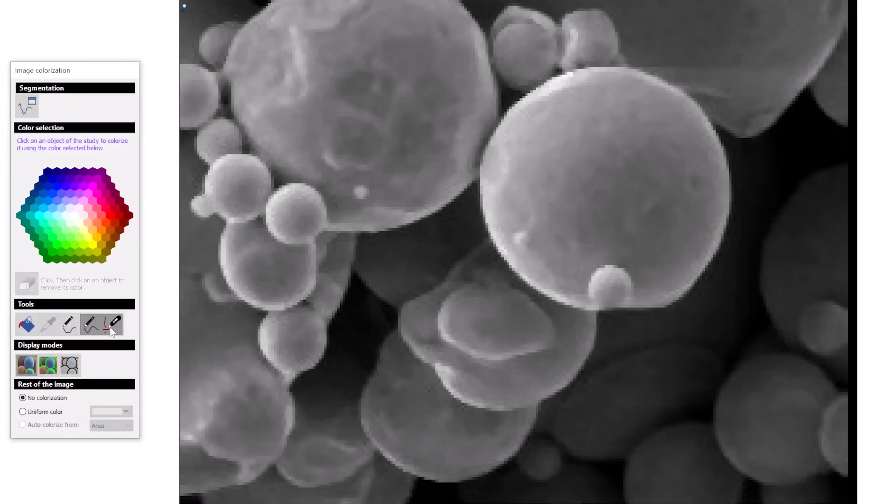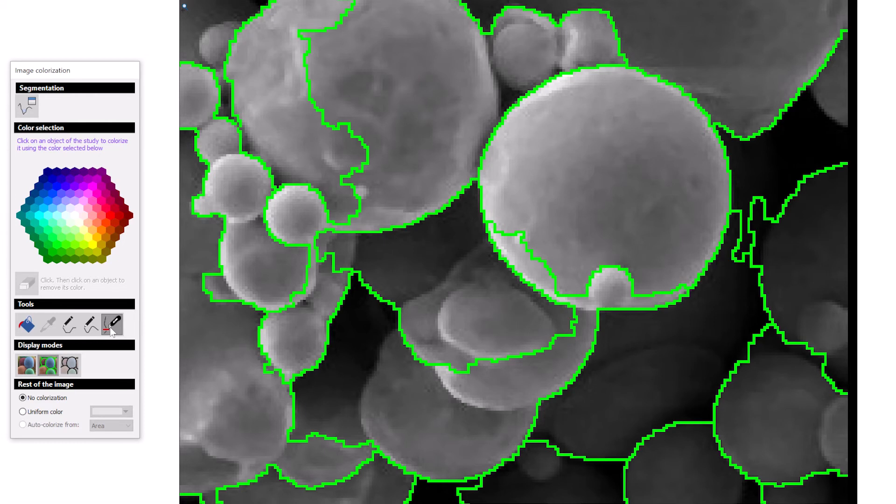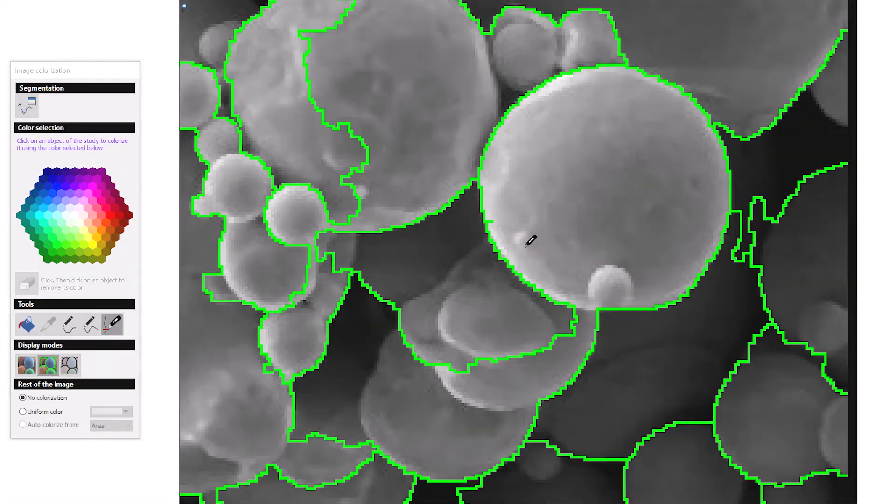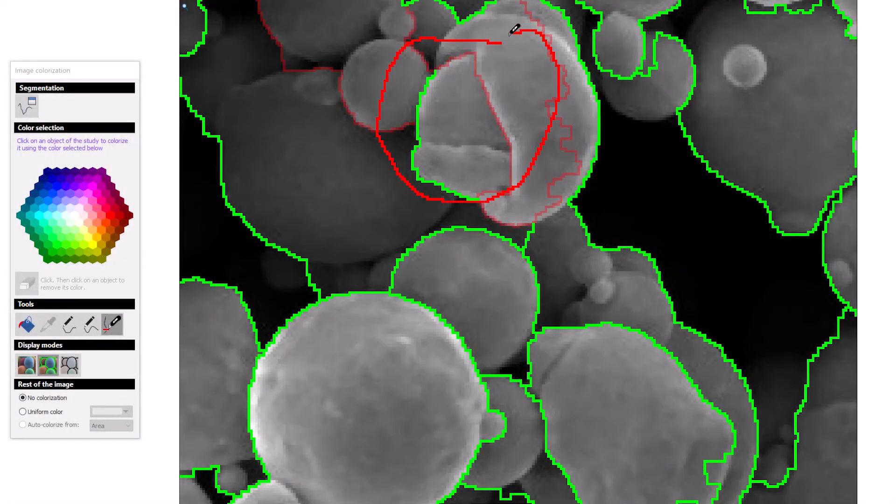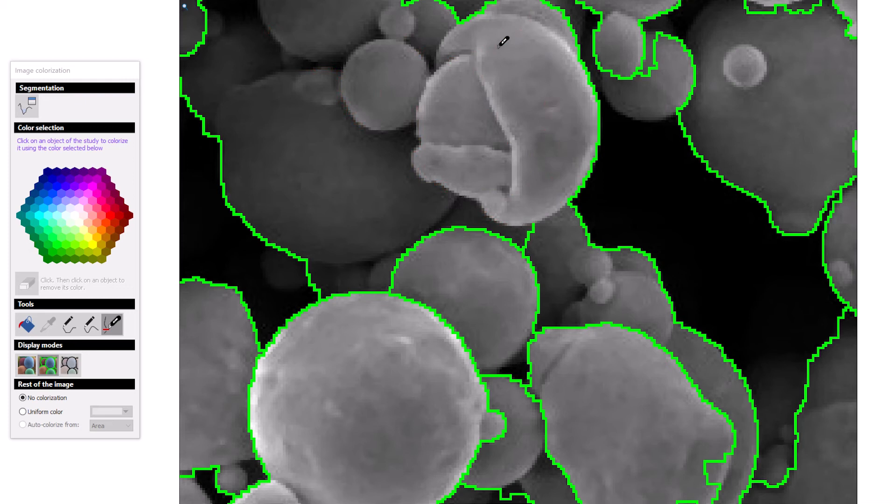It is possible to remove unwanted borders. Just click and drag the cursor over the borders you wish to delete. Notice when I draw a circle with the cursor, all the borders inside the circle are deleted too.